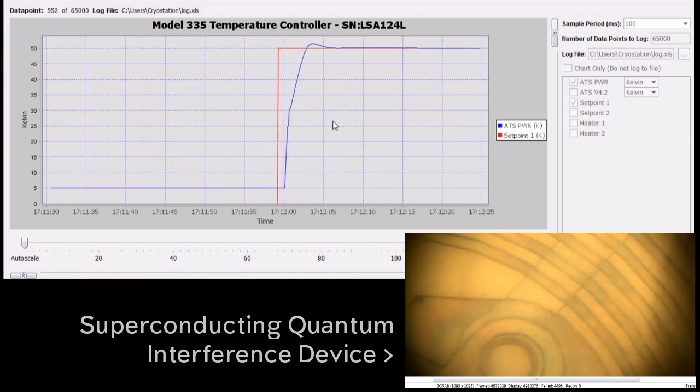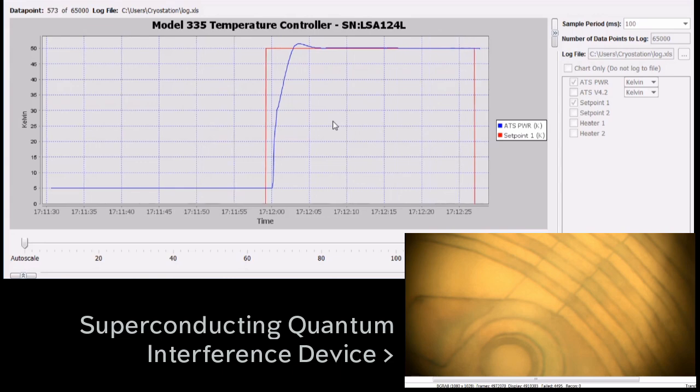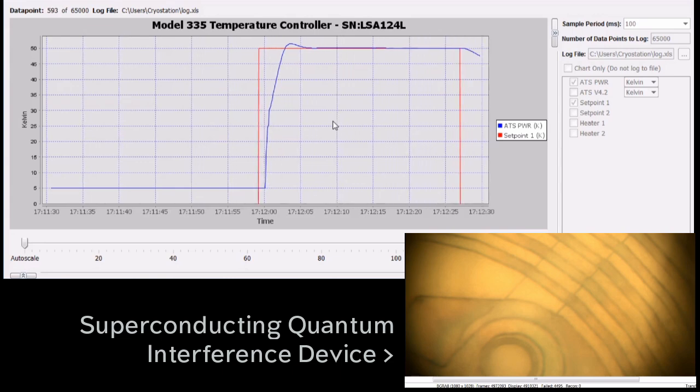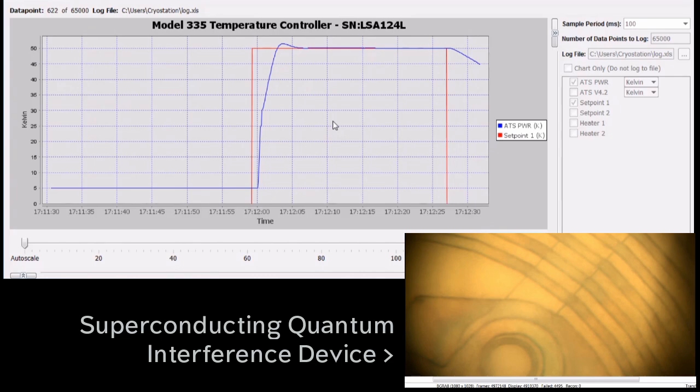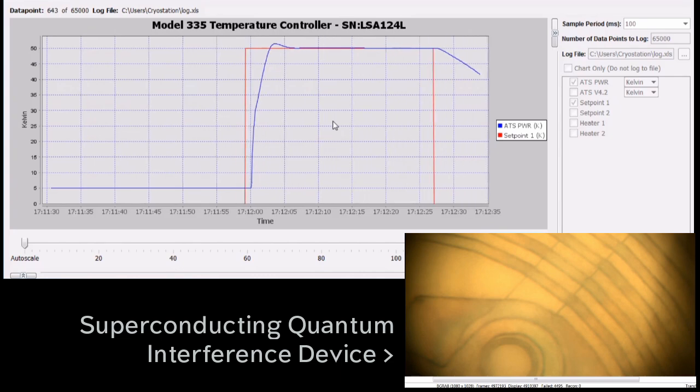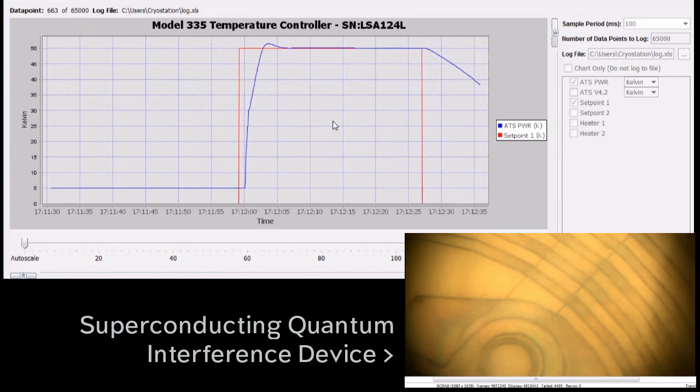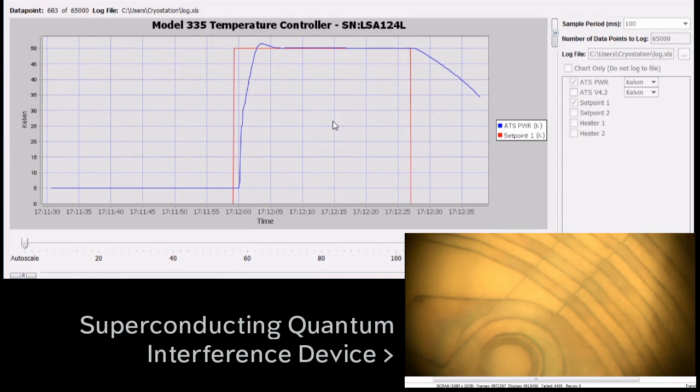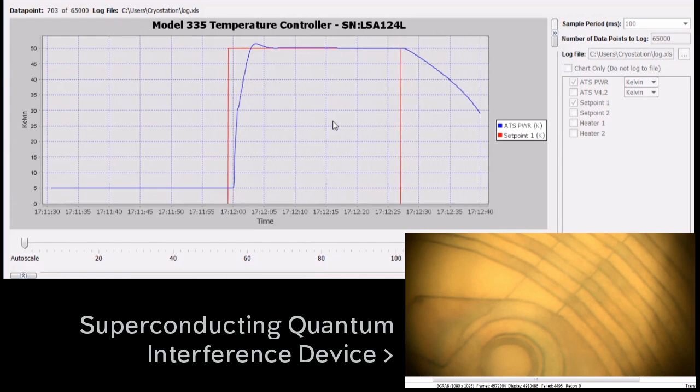Now if we change the set point back to zero, simply going back to base temperature, you'll see it takes a little bit longer. But if you keep an eye on the image of the SQUID, you can see there's really no change in the XY plane and minimal change in the Z plane.